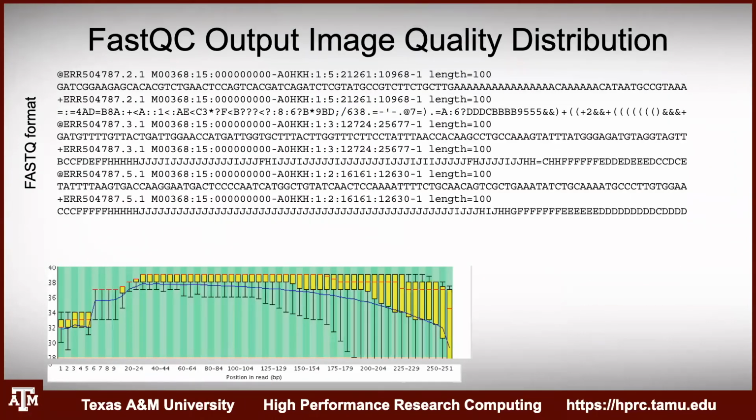All right, the first image that we looked at was the quality per nucleotide position in the reads. This is actually a very typical pattern of what you see in Illumina libraries, where these are still good scores down here at the 5' end, but they creep up once you get 20 or 30 nucleotides in, where you've got this really high quality of 40.